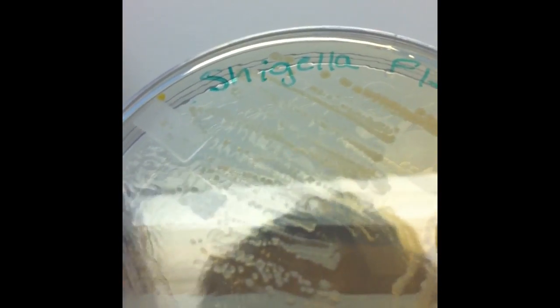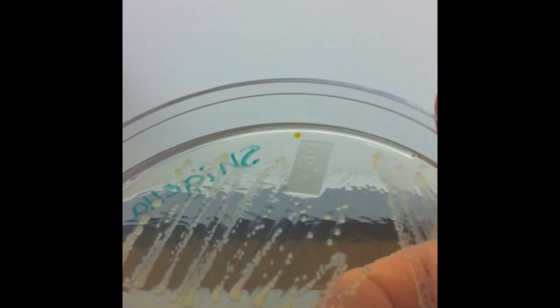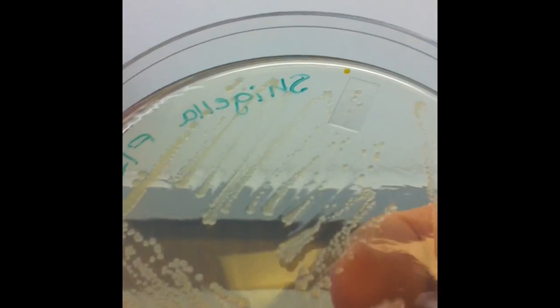Shigella flexneri. Similar to what we just saw with Staph epidermidis, we have small, round colonies. They're a little bit more translucent, kind of a creamy, not quite clear color than the Staph epi we just saw. And as I tilt the plate there, you can get a little bit better look at the overall shape of those colonies.